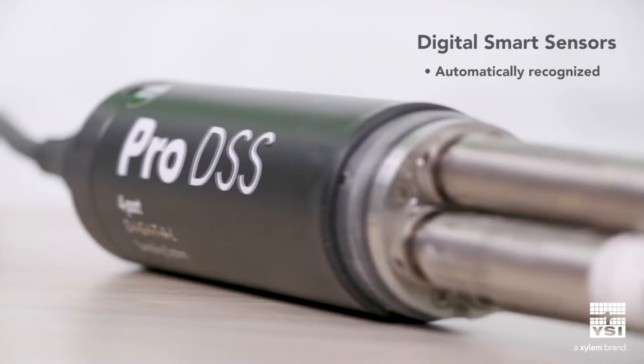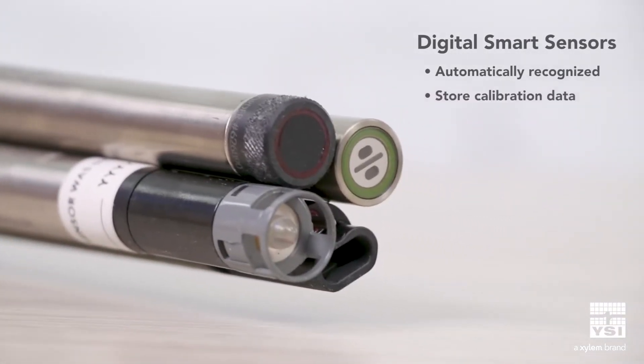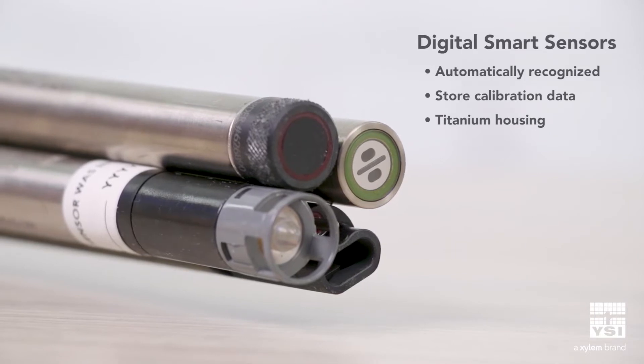Digital smart sensors are automatically recognized by the Pro DSS for fast, easy setup, and also store their own calibration data. Pro DSS sensors are built with durable titanium to last longer, even in harsh field conditions.